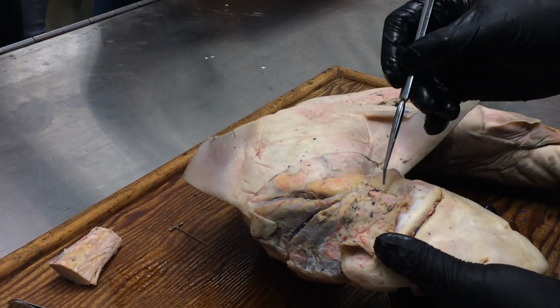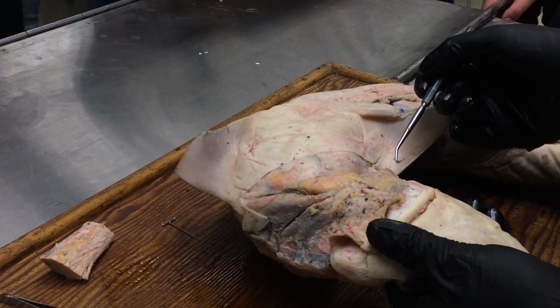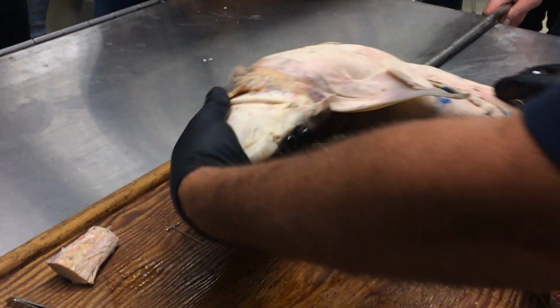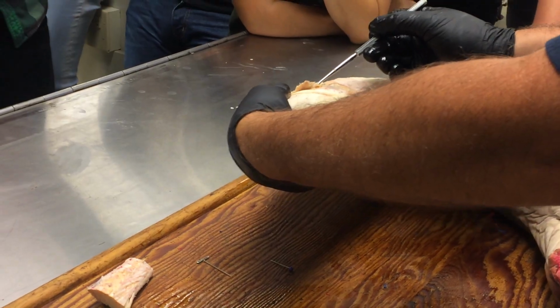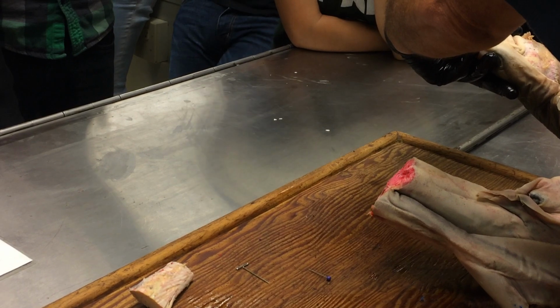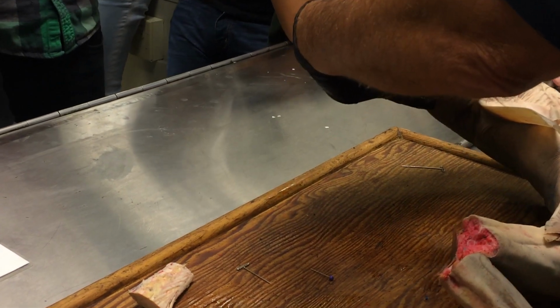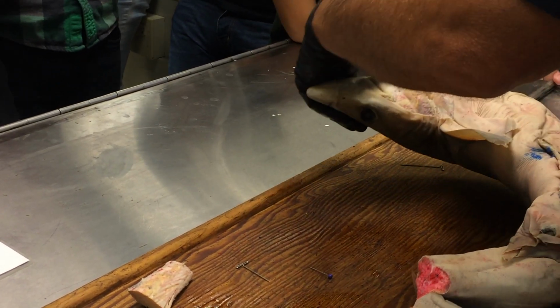And those fibers are running across from the ceratohyal cartilage of one side to the ceratohyal of the other. And you see that in here. This guy. And so for a lot of you, what happened was you just went through both layers at the same time, and that's understandable.